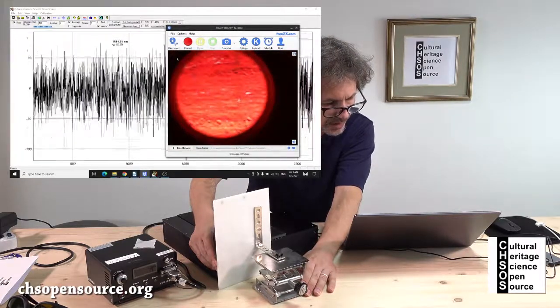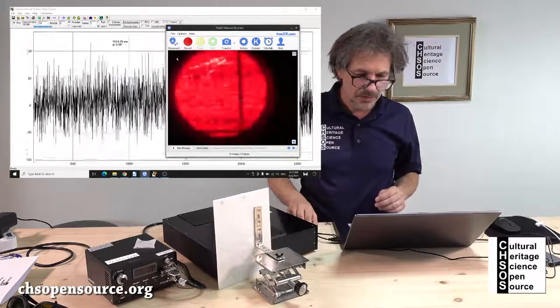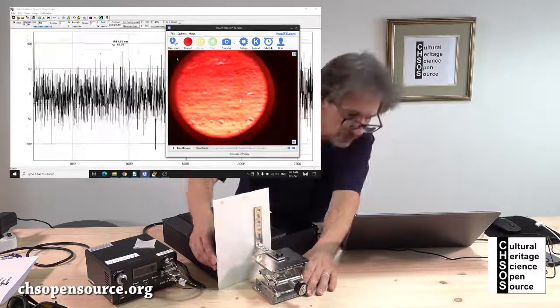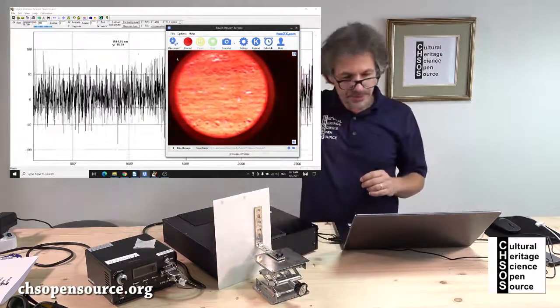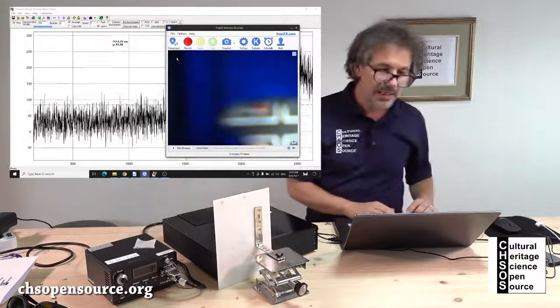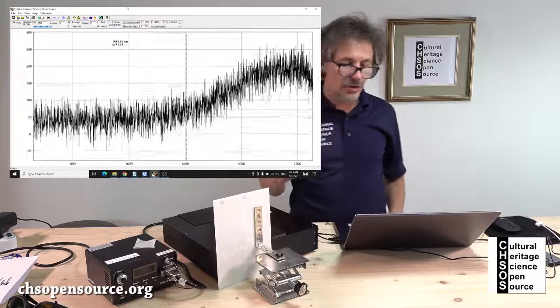Okay, there we are. Okay, maybe too close, a little bit less. Okay, there. At this point, we can turn off the camera. We don't need it, and here we are. So we can turn on the laser.